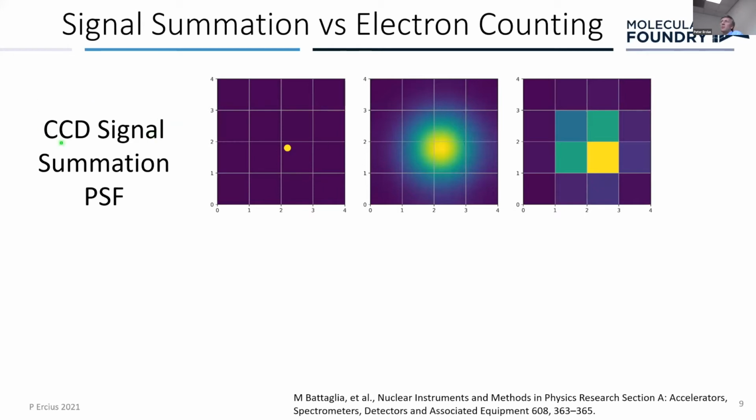So in a typical charge coupled detector, or CCD, the old style detector, an electron would hit a phosphor, and then the CCD would actually look at the light that was produced by that electron, but you'd get this large point spread function. Even though I'd want to know that the electron hit a certain pixel, we get charge deposition all around the detector. This doesn't even take into account the noise of the detector in the background. And so your final image would be this high peak in the middle with this spread of electron energy all the way around, which gives you this blurring effect.